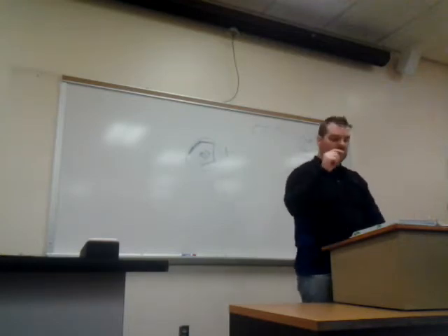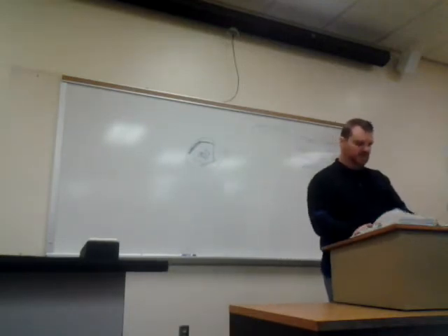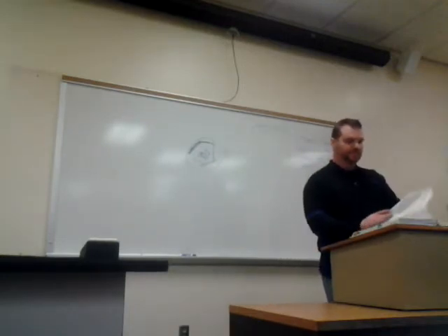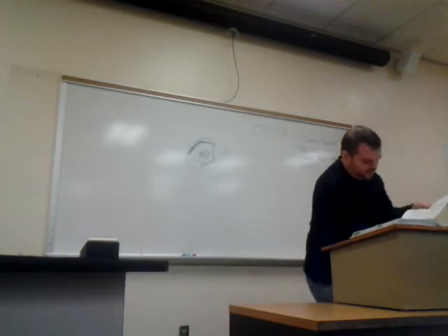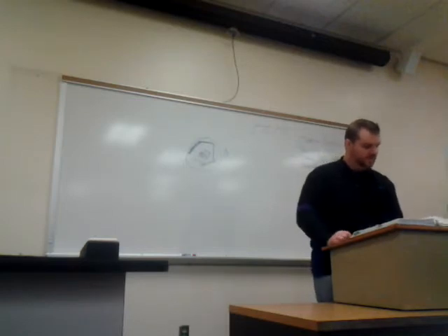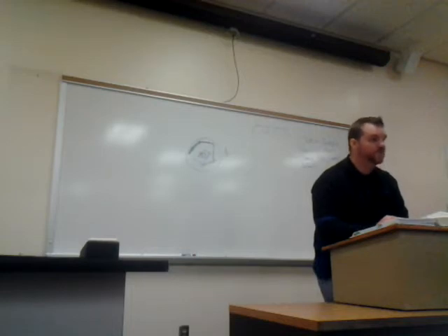We call that a clear zone. It's harder to see. I think they have a better picture. Maybe they don't. Yeah, actually, they have a better picture on 298. So you can see that some of those have little circles around them, little lighter circles.